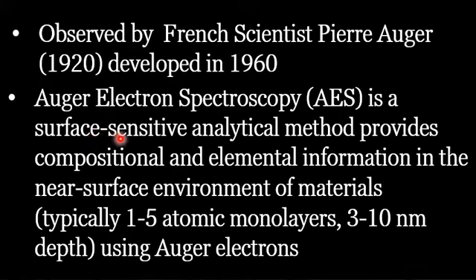surface sensitive analytical method which provides compositional as well as elemental information in the near surface environment of a material, typically in 1 to 5 atomic layers or 3 to 10 nanometer depth, using Auger electrons.